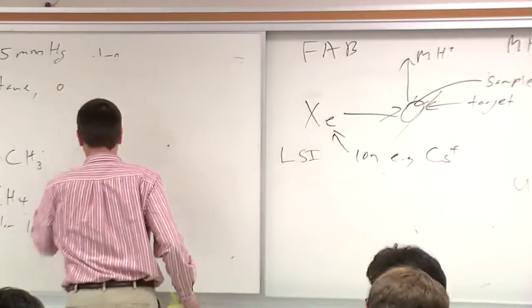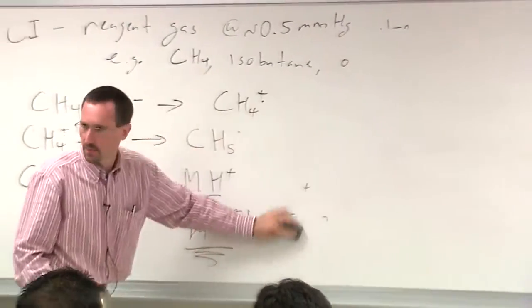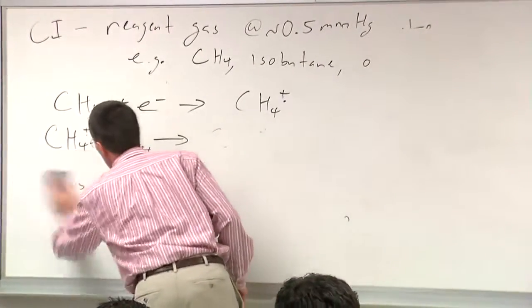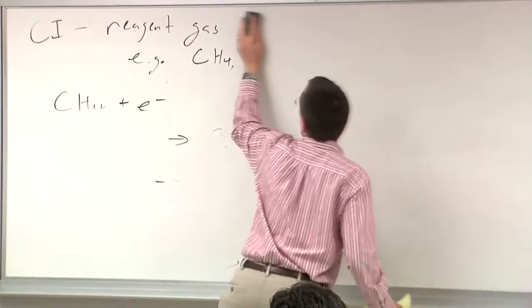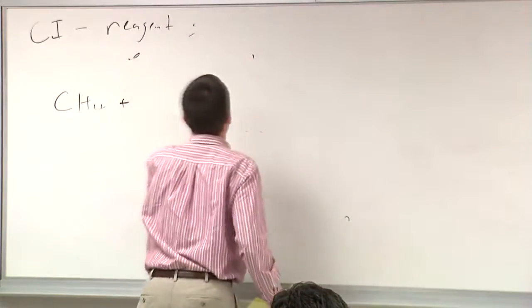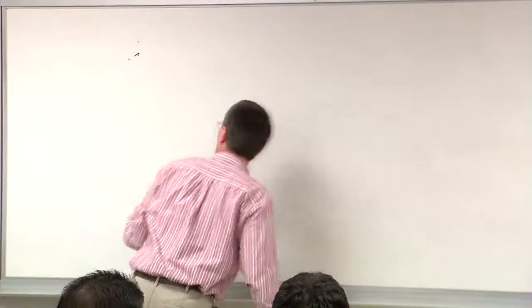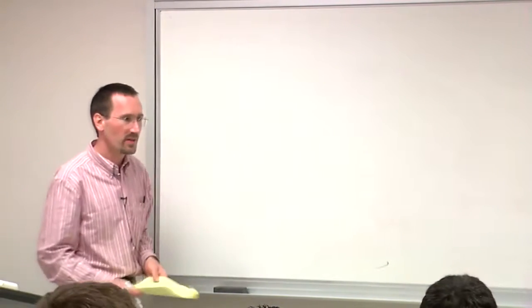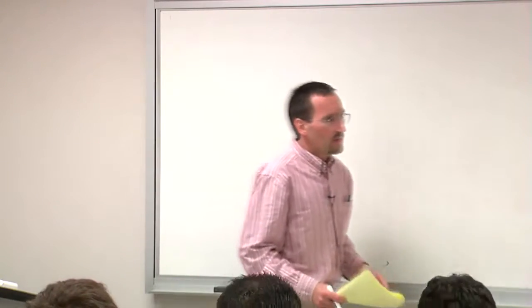Is that for the fast atom bombardment? For fast atom, well, both of the techniques, but fast atom was the one that first was popularized. John Greaves does the LSI technique. And again, I'm sure he will wax poetic on the differences between the two techniques, but for your purposes, they're pretty similar. Sorry, so does that change the type of detector you can use if the molecule's really big?